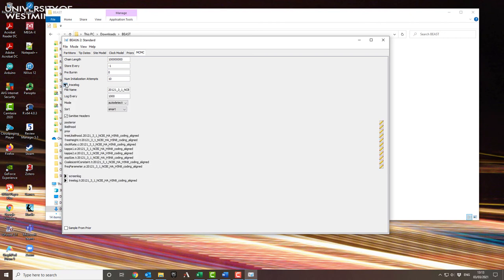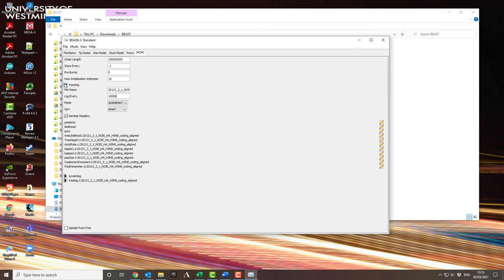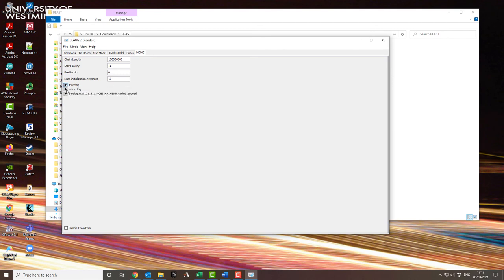I also need to change the trace log, because otherwise it'll be recording every 1000 steps onto your computer the result, and that will end up with a very, very large output file that you'll find it very difficult to analyze. So increase that by tenfold as well.